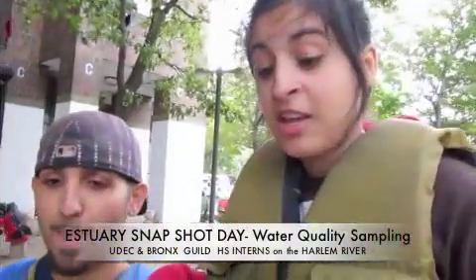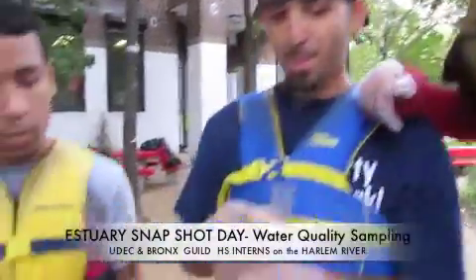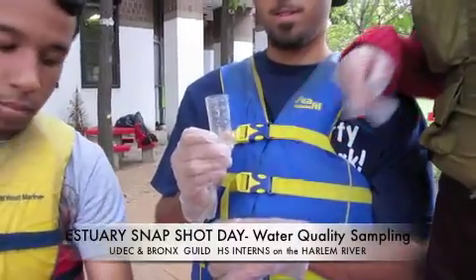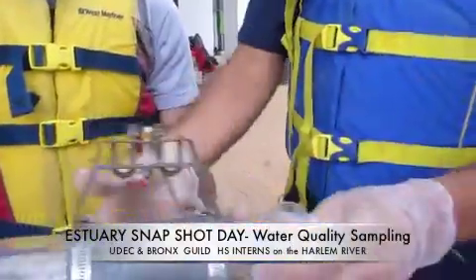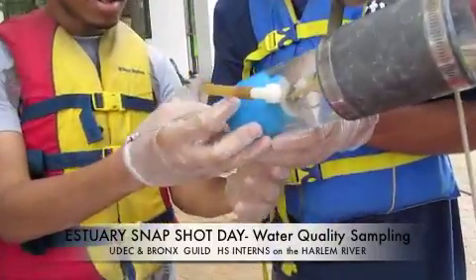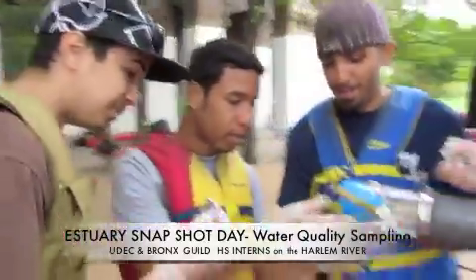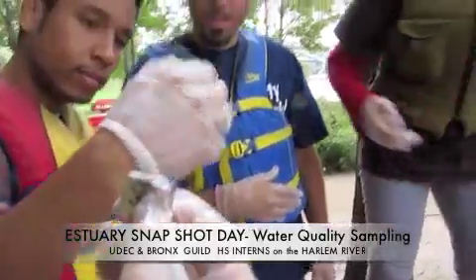We are going to be conducting a nitrate test for the Harlem River. First, we are going to be filling up this tube to the 15 milliliter line. Okay, so let's fill it to the 15. All the way down. Trying my best. This is way too small, actually. Okay. 15 milliliters. Kind of went over the line.